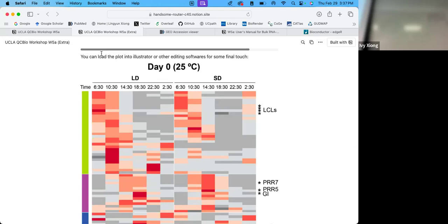You remember at the beginning, something was supposed to download on Hoffman. Yes, sorry. Yeah. So this works. Mine said it downloaded, but I don't... We are trying to get that way, the long solution.